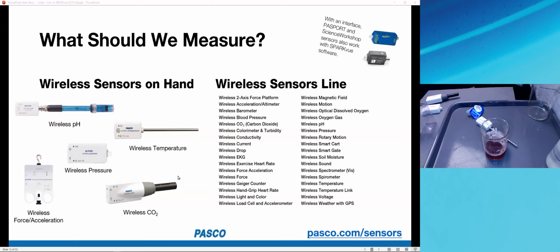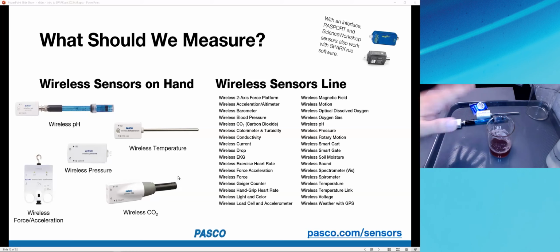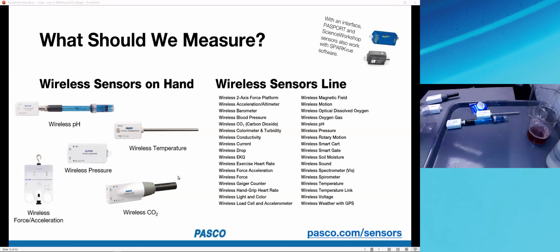Thank you for putting in a Ziploc bag. Let's go ahead and measure two things at least. We have a lot of opportunities here. I'm going to keep the reaction in this open beaker. That necessarily constrains us to not really trapping the gases. But let me grab a different beaker with the same amount of juice in it, and I'll grab another antacid tablet. The question I have is something about antacid here. If this is called antacid, is it going to change the pH of this solution of juice when we add the antacid tablet? So let's take a look at two things at a time.